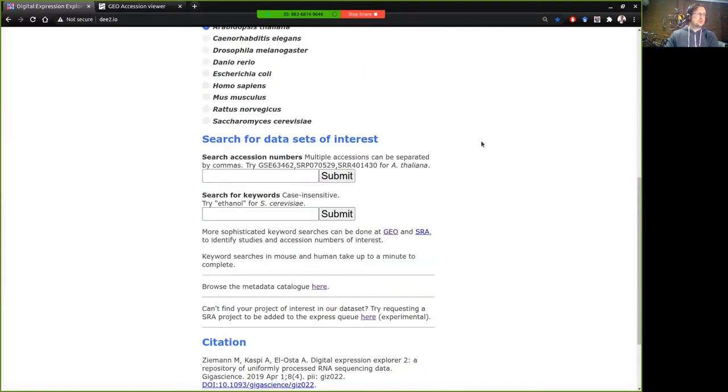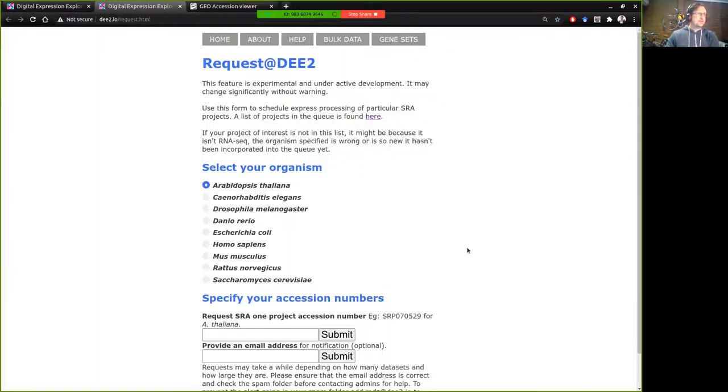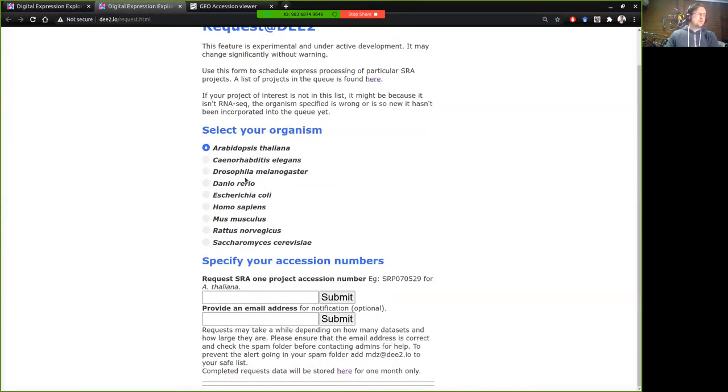So to access that, currently it's an experimental feature so it's kind of buried here at the bottom of the page. So we'll click there and as you can see we've got some instructions here and the web form operates very similar to the original web form.